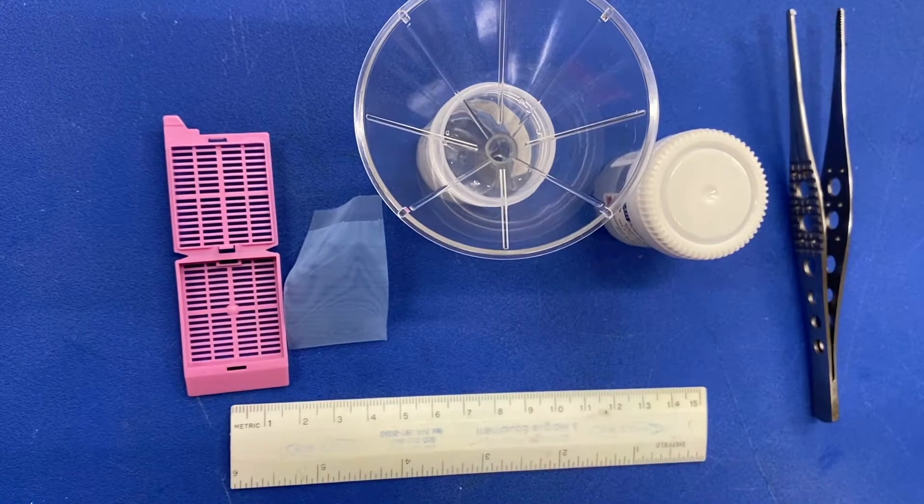Hello, my name is Roseanne Vitale, and this video will cover the basics of processing biopsy specimens.